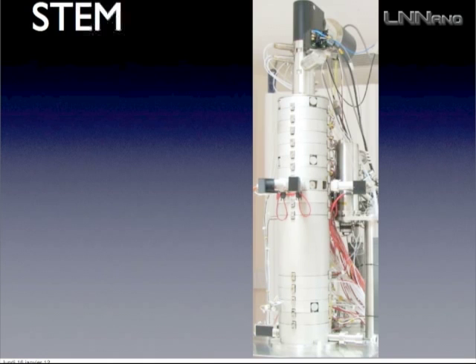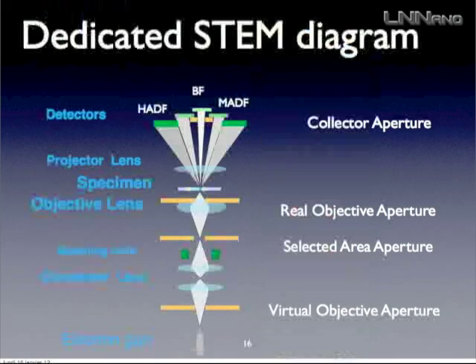and you have the columns there. So from now on, I will use this convention of putting the gun on the ground and the detector on top. And we will see after this description that there is another meaning to doing this.